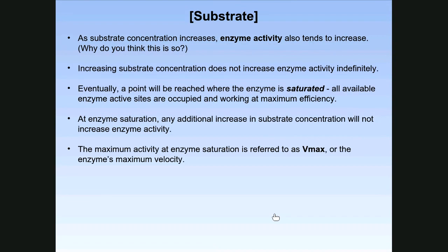The last factor you'll study, which is actually the first part of the lab procedures, is substrate concentration. Okay, we talked about this. This is one of the 6 factors that affects enzyme activity. Simply put, enzymes can't produce enough product if they don't have enough reactants, especially the substrate.